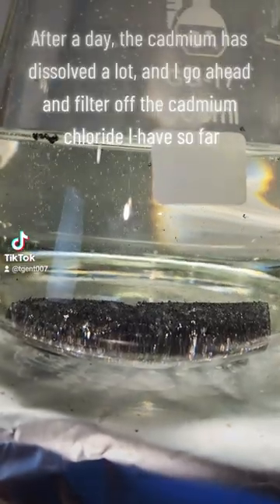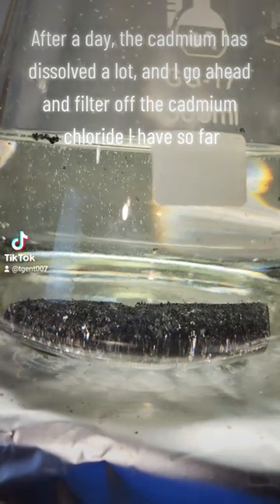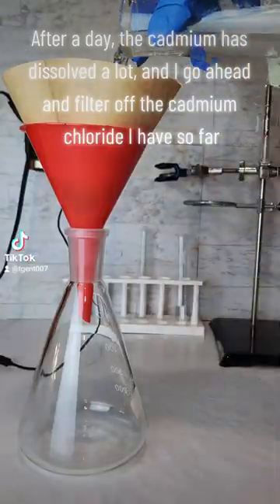After a day, the cadmium has dissolved a lot, and I go ahead and filter off the cadmium chloride I have so far.